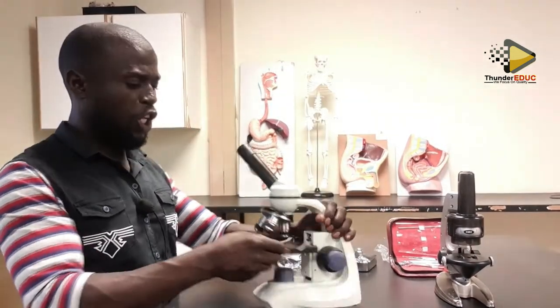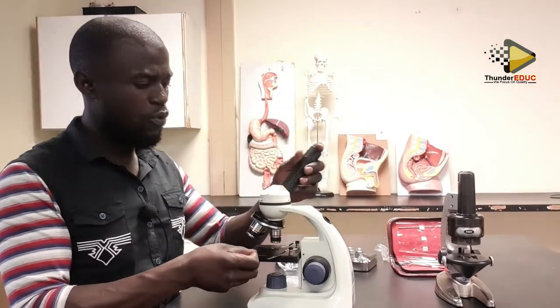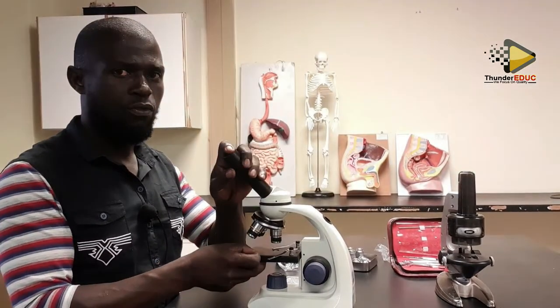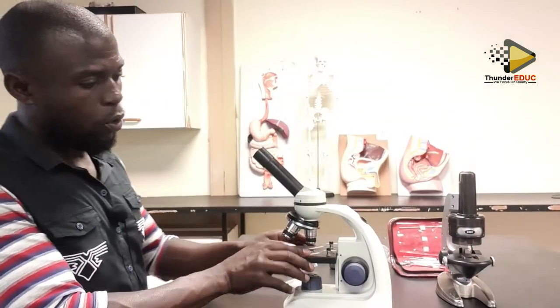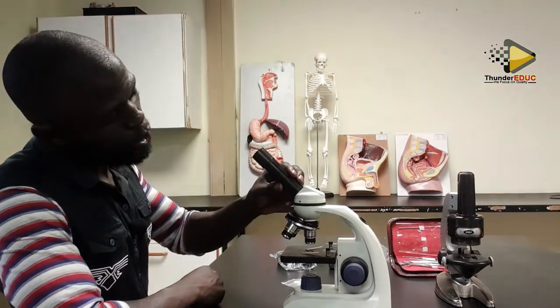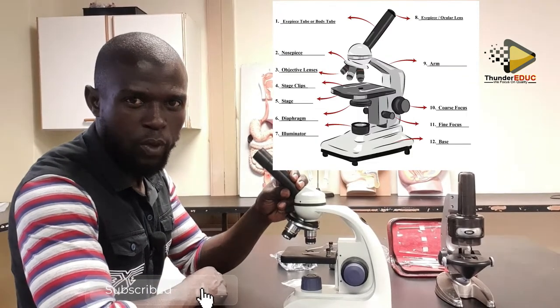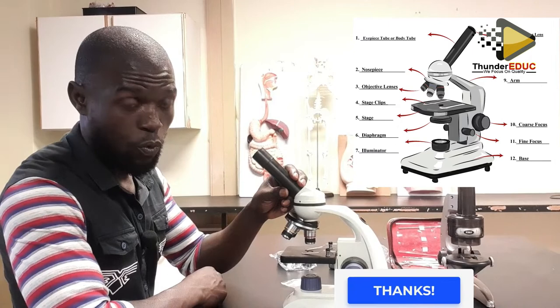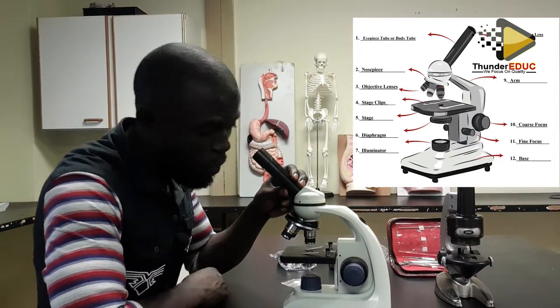You don't need to change the microscope all the time. No, no, this can move. All right. The microscope has what's called the eyepiece. It has this tube, which you call the eyepiece tube. This is the first part where you put the eye to view.